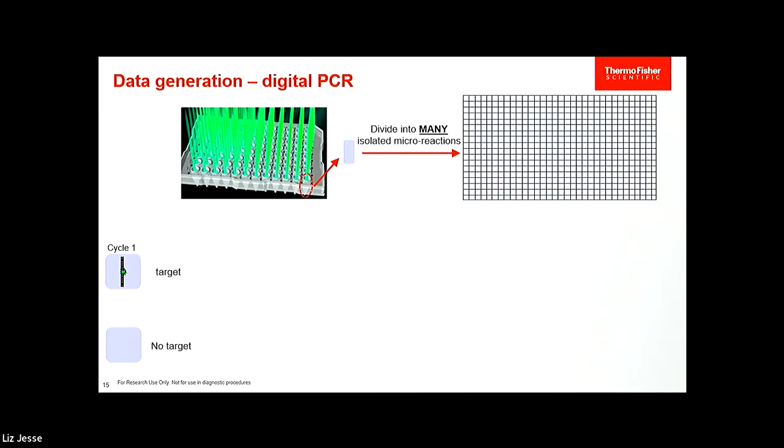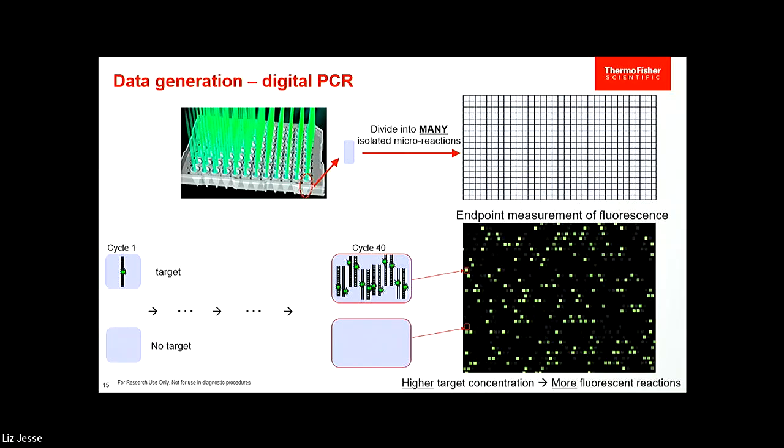The benefit here is if you envision you have, say, 50 molecules that you're going to amplify in a qPCR reaction, when we spread them out over the grid, those 50 molecules will find their own spot to reside. This way, you have some wells that have a target of interest, and some that will not. You envision now we're not worried about the amplification cycles in between. Now we're only concerned whether or not we're going to see amplification at the end.